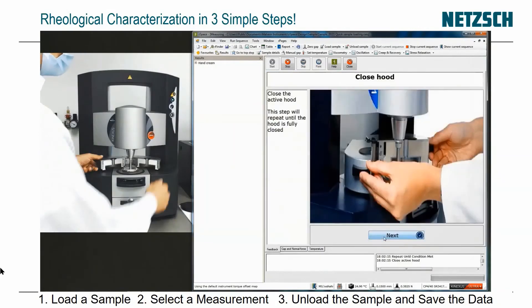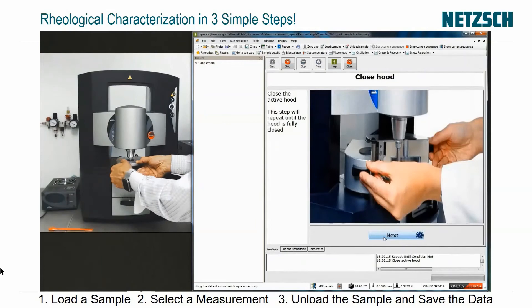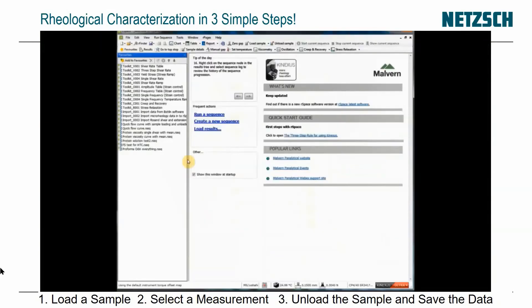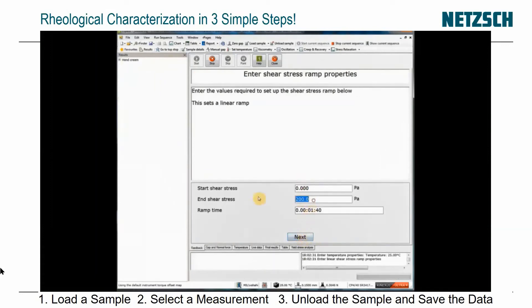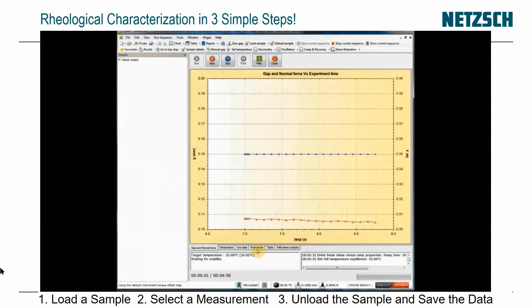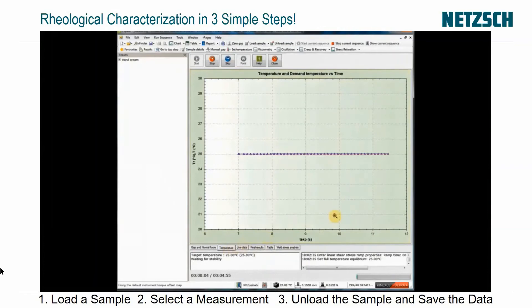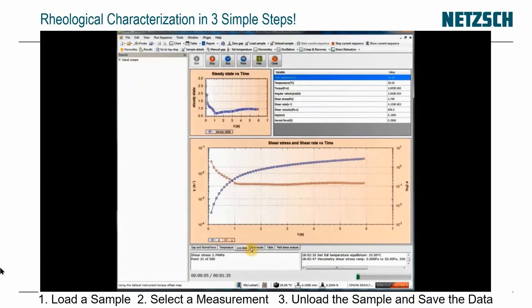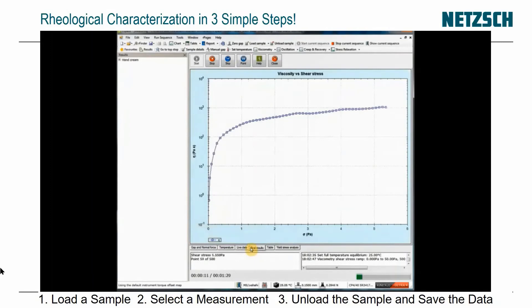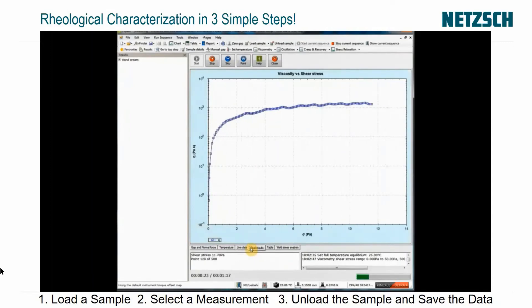Now I'm clicking Next and it prompts me to close the hood. Now I just need to go in to run a test. I'm clicking Yield Stress Test and I want to do it at 25 degrees C, from 0 to 50 pascals. I type in my stress range and the test proceeds. I can see the temperature is about 25 degrees C and I watch the live data being accumulated. I click on the final results to see them. Let's speed this up a little.